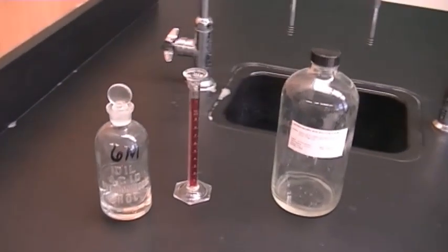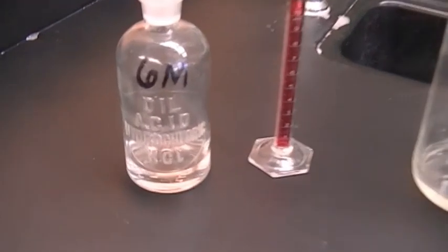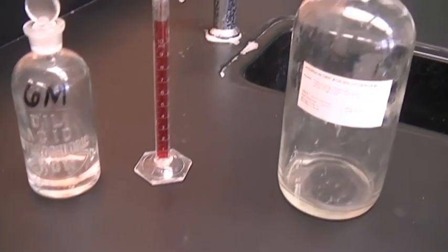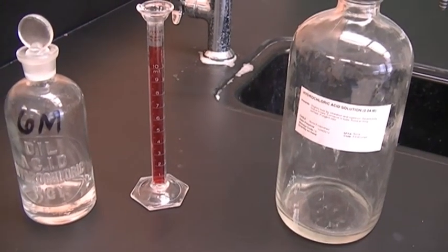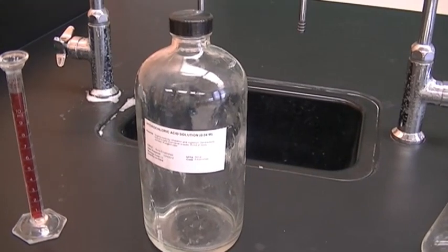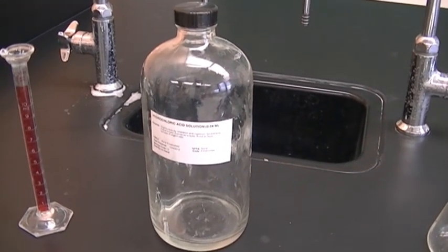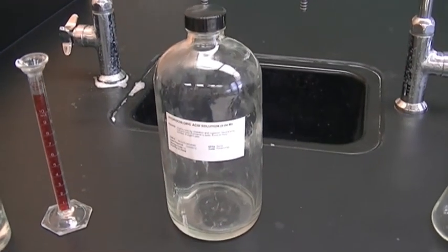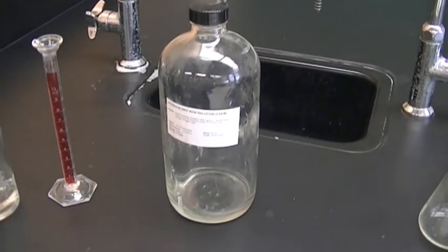All right, so the setup is here. I have my 6 molar hydrochloric acid. I'm going to take 6.7 mils, measure it out with my 10 mil graduated cylinder. I'm going to pour it into my glass bottle for the acid, and then I'm going to go over to the deionized water and fill the bottle. I am not going to measure the water. I'm just going to fill the bottle with deionized water.